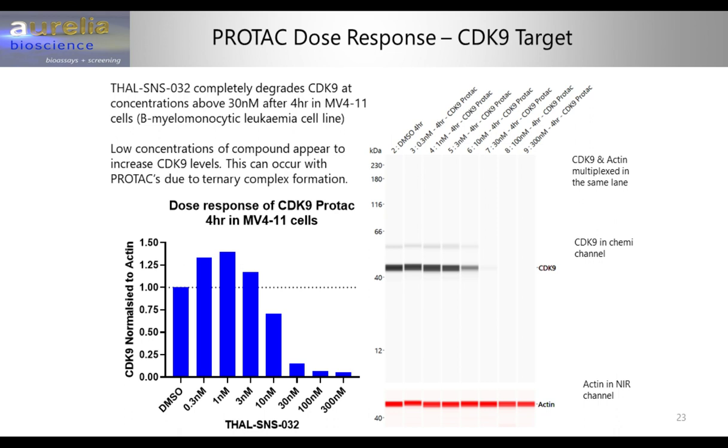Hello, yeah, this is indeed acceptable, because in comparison to Western blot, the instrument itself always takes this kind of 50 nanoliters out of each well of your sample. And even if you would have not properly calibrated pipettes, meaning you would pipette, let's say 3 microliters, 4 microliters, 5 microliters from your sample in wells next to each other, you would get the same result. So on our technology, it is possible to load your sample in different wells and compare them amongst each other.